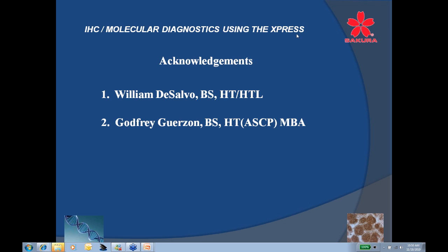Thank you. There's a question that's posed. Is there any comparison data for molecular-friendly fixatives versus formalin? And I can go ahead and answer that question, Lamar. And yes, Evelyn, we do have, or there are papers that were written, and I can definitely send you those after the completion of this webinar. Would you like to add anything to that, Lamar?